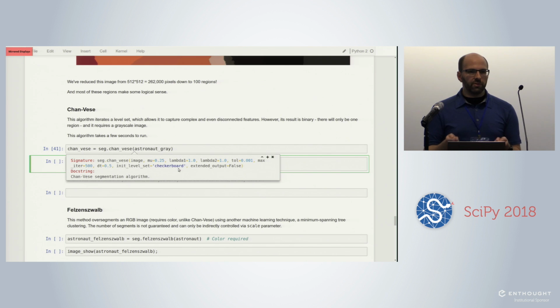And then over time, instead of moving the actual individual points around, it's changing the way that it's bent in space, positively and negatively. And then the level part of the level set is where you threshold that, usually around 0.